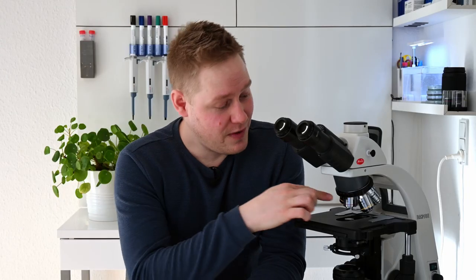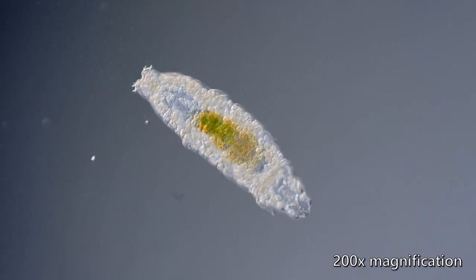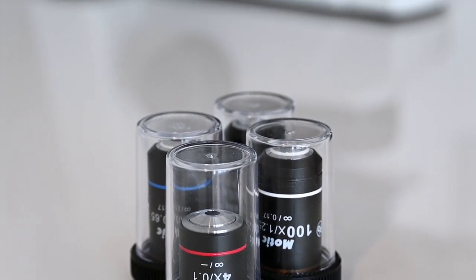This model comes with a 4, 10, 40 and 100x objective, as well as two 10x eyepieces giving a total magnification of 40 to 1000 times. This microscope can hold up to 5 objectives, and I have personally added a 20x objective to mine, as well as replaced the 100x objective with a 60x objective, as I have way more use of that.